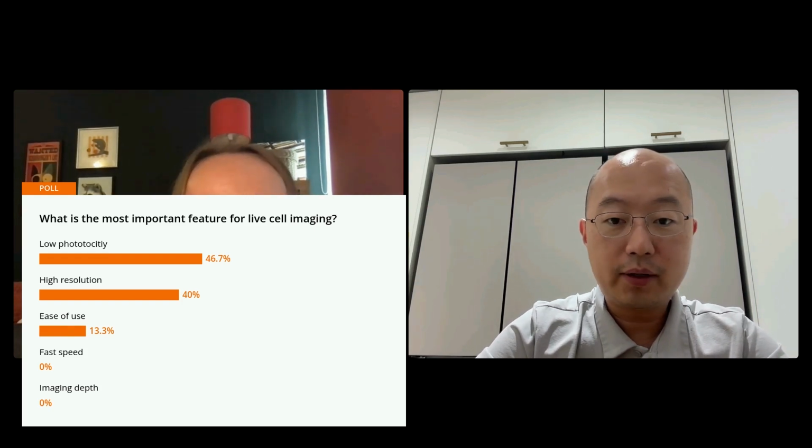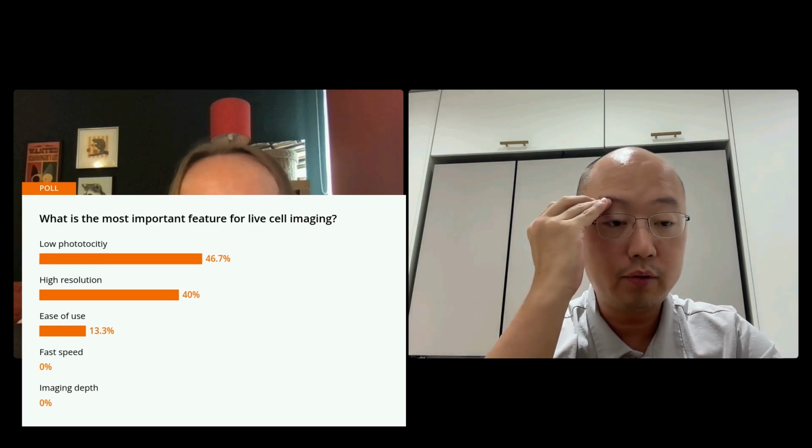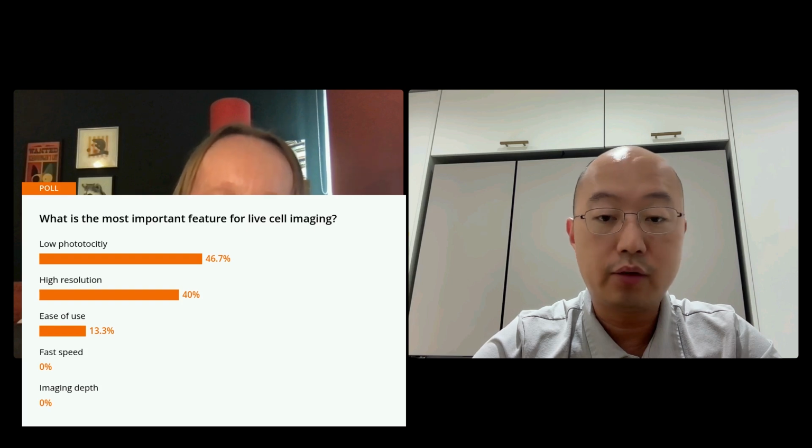Yeah, I think this is a very interesting result, because we also expected many responses regarding imaging depth, but it's good to know that many of our audience are interested in low phototoxicity and high resolution, which is the strong strength of our holotomography system.